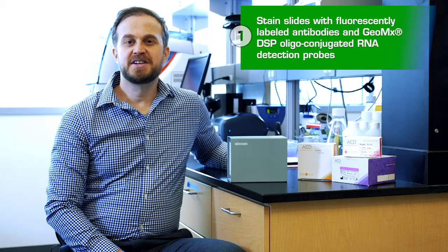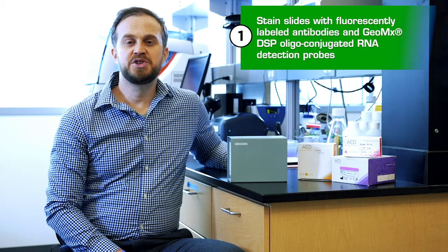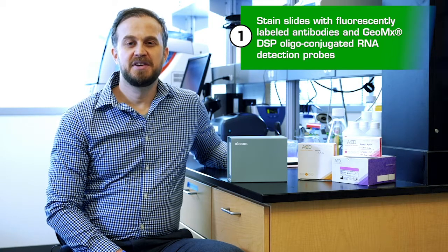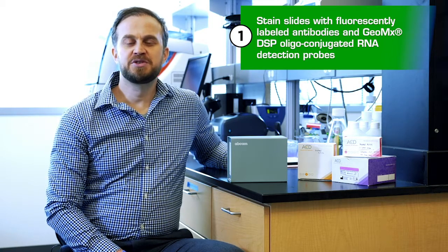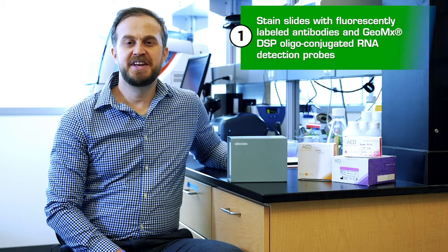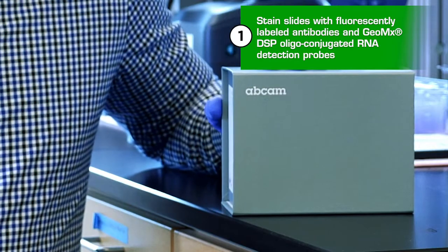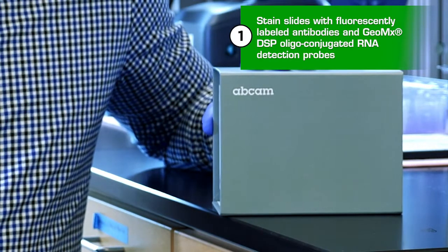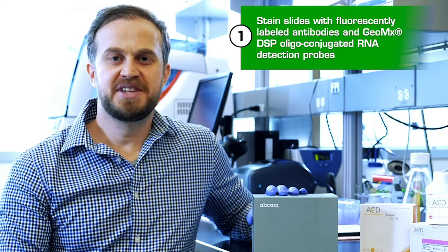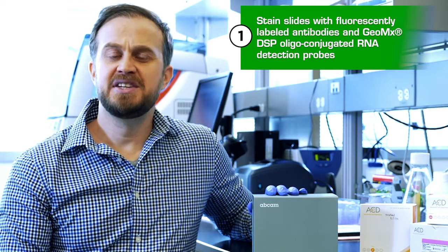Morphology marker selection is key to GeoMx experimental success. The platform is compatible with any fluorescent antibody. NanoString and Abcam partner to provide custom protein content for quantification based on large IHC catalog Abcam provides. This content can also be utilized for ROI selection.